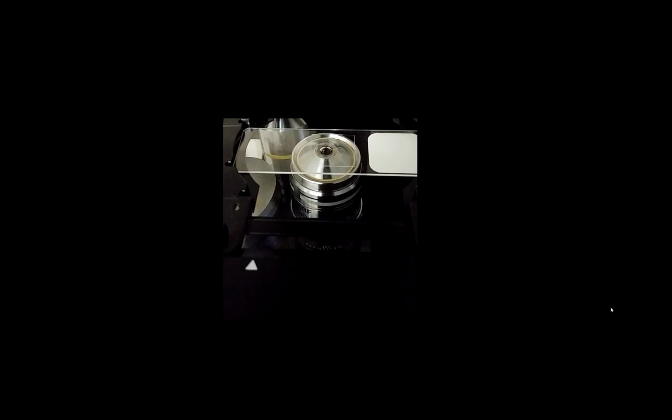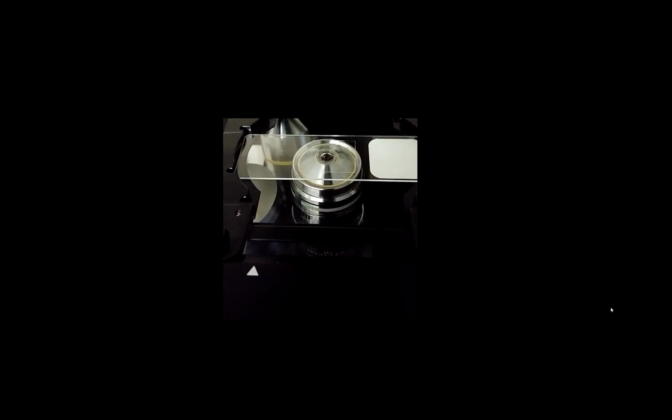The way this might look, if you were to stare at the objective, is while the structured light is happening, you can see in this video that the light is rotating around at many different angles. So in practice, you're just going to take many different images with each one of your lasers at different angles and then use those images to reconstruct a higher resolution image.